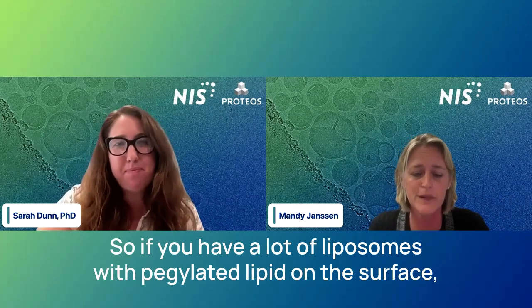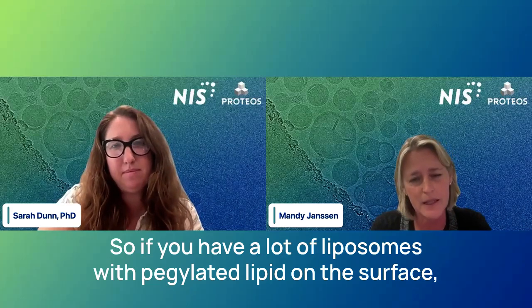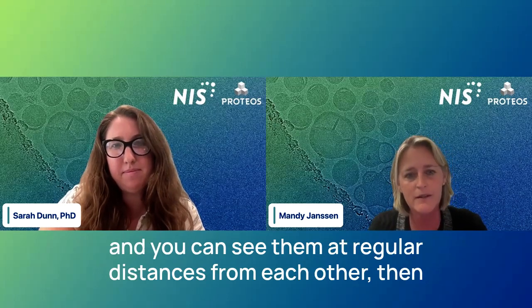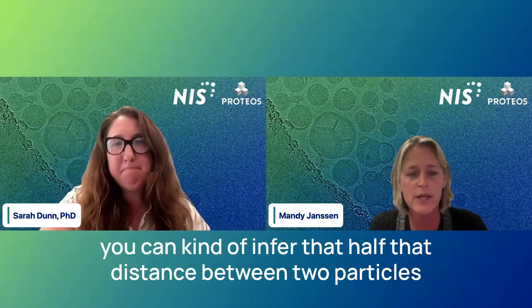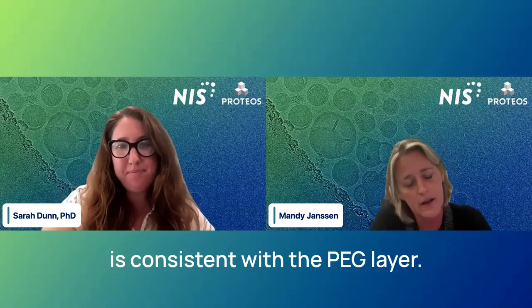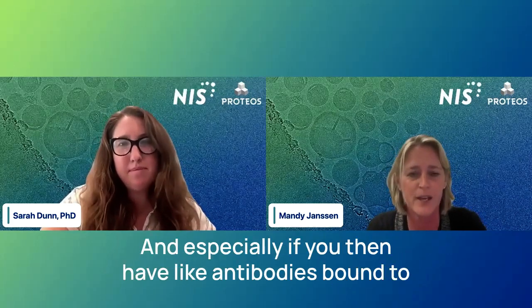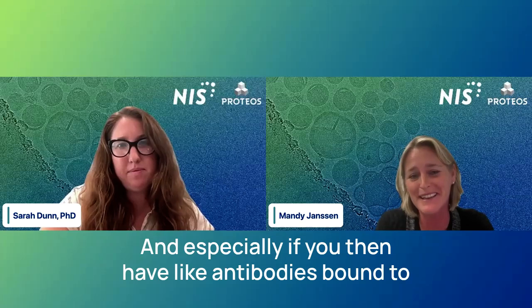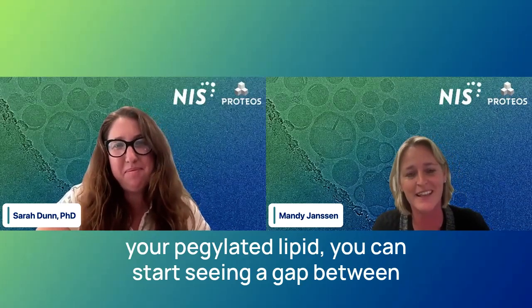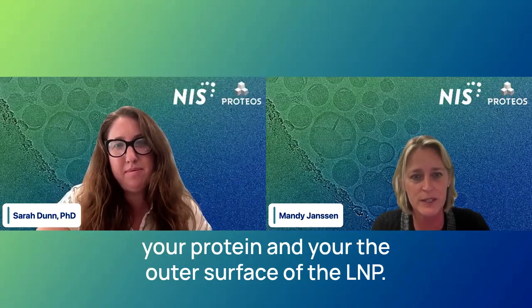If you have a lot of liposomes with pegylated lipid on the surface, they tend to not touch each other. So if you have a high enough concentration of LNPs in the image and you can see them at regular distances from each other, then you can infer that half that distance between two particles is consistent with the PEG layer. And especially if you have antibodies bound to your pegylated lipid, you can start seeing a gap between your protein and the outer surface of the LNP.